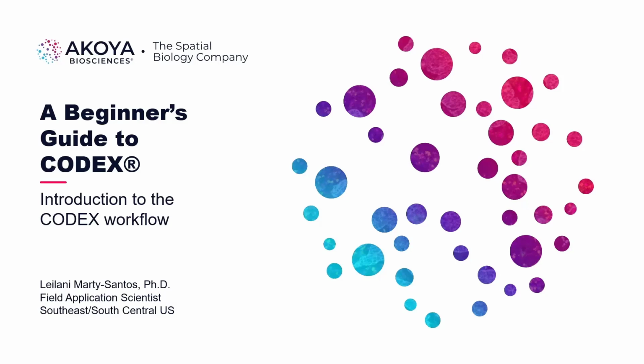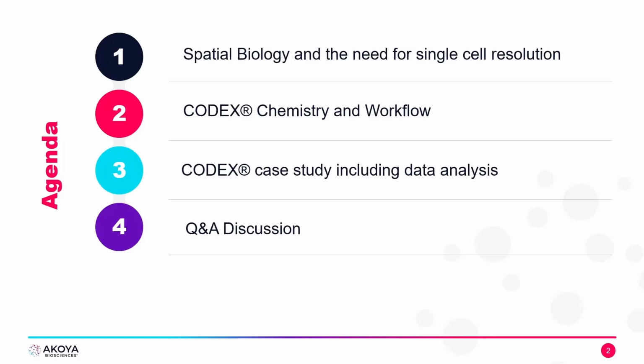Today, I will be presenting a beginner's guide to Codex as an introduction to the Codex workflow. In this webinar, we will be covering spatial biology and the need for single-cell resolution, the Codex chemistry and workflow, a Codex case study including data analysis examples, and at the end, we'll have time for questions and discussion.